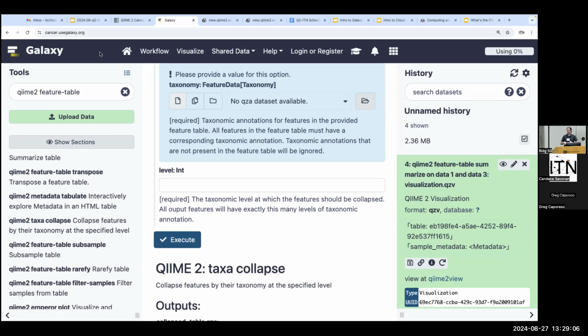But we're, like I said, waiting in a queue. We're waiting for some machinery to be ready. If we were to run a job on here that normally would take 12 hours or 16 hours on our computer, we wouldn't really notice that difference probably when we're running it on Galaxy, and we may have the potential to make more use of the high performance computing resources, make more use of the many processors that are available, like Carrie was talking about this morning.